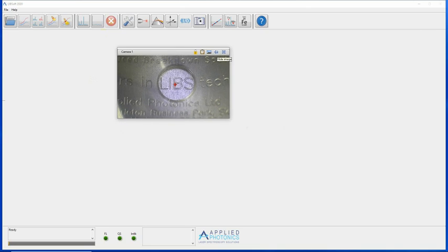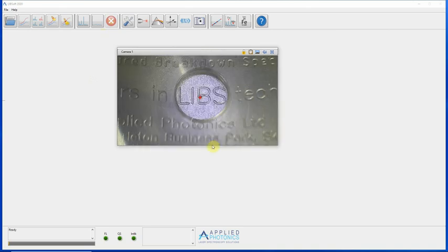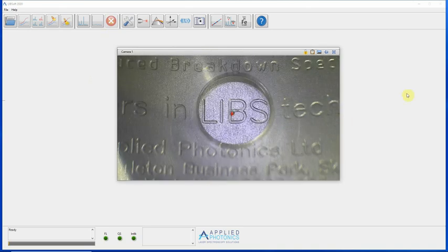It can also then be resized either horizontally or vertically. Note though that the aspect ratio of the window will be maintained when it is resized. For a two-camera system, the second video display can also be unpinned and then repositioned and resized in the same way.